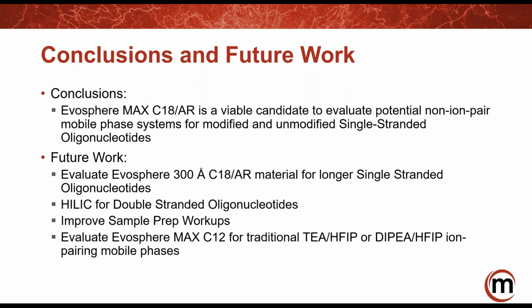And usually you have to use fairly high temperature to get the stuff off the column, where the C12 can handle that in the Max hardware. But you need it in the Max hardware because you don't want to passivate these things. The oligonucleotides are so expensive that it just makes sense going with the inert coated hardware.